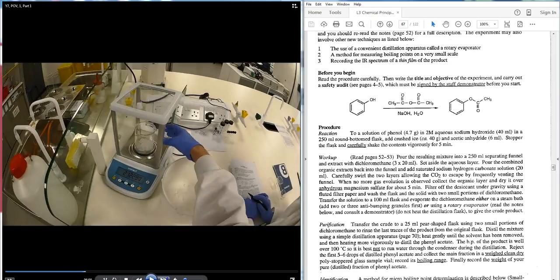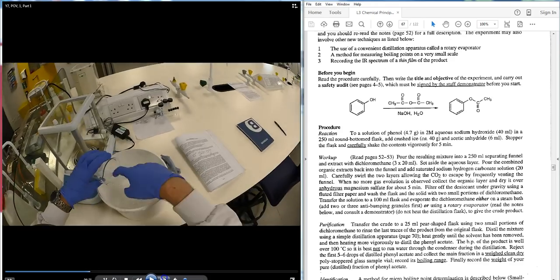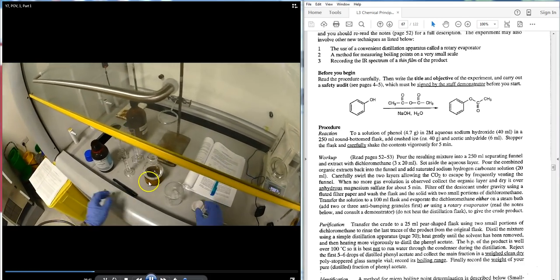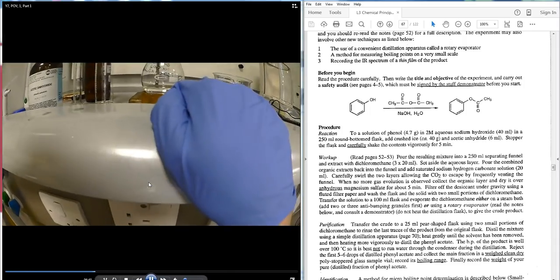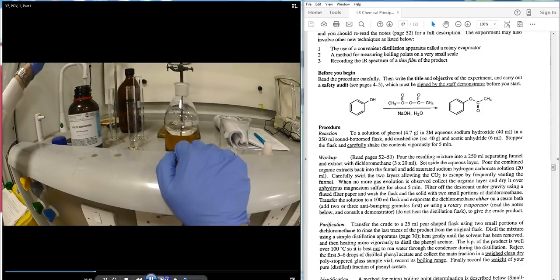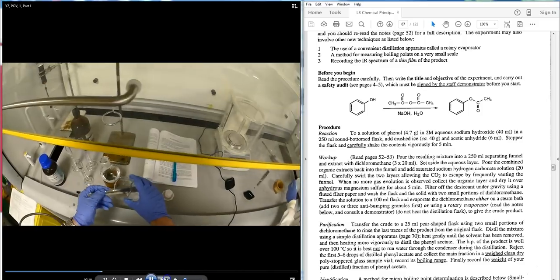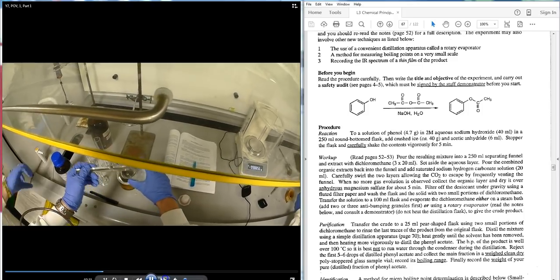The student is happy with the measured ice and is now going to place it into the flask. The ice is scooped in — ideally using a spatula rather than by hand.